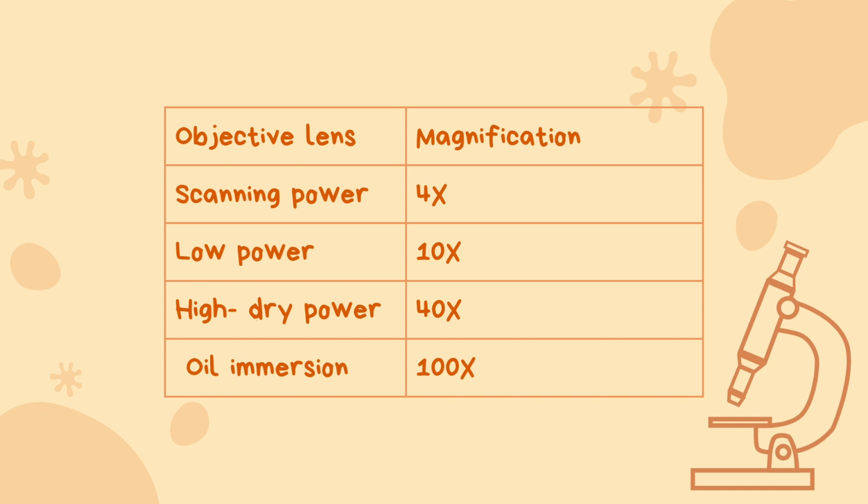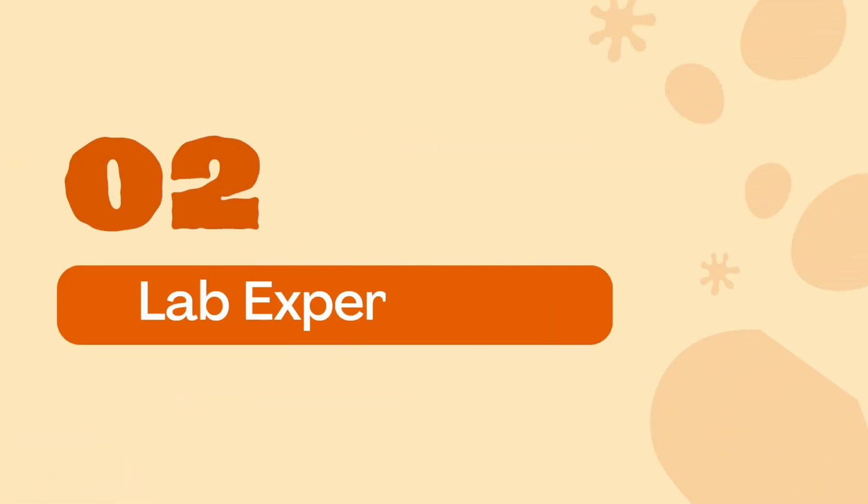As we increase magnification, our field of view decreases, making it imperative to adjust our focus and positioning carefully to observe our target cells. In our mitosis lab, we utilize these principles to not only observe but also estimate cell sizes at different magnification levels.